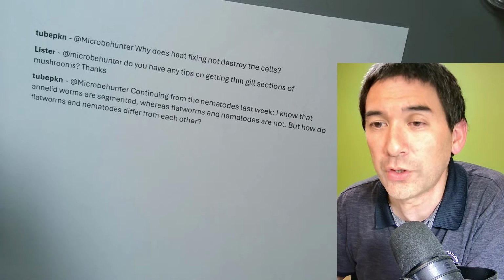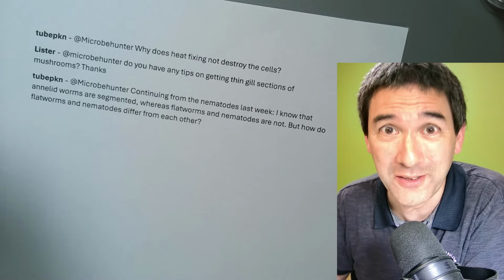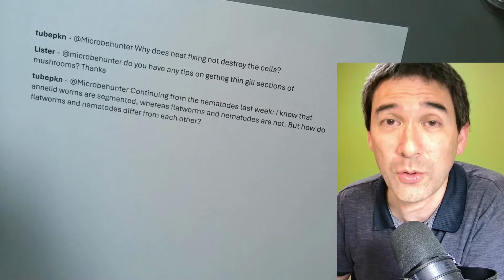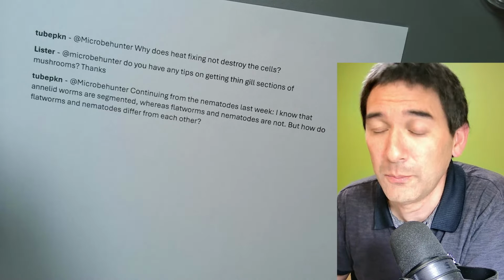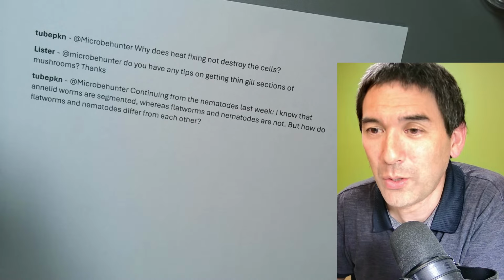Can you put yogurt under the microscope? Yes, I have done this as well. You see yogurt bacteria. As a matter of fact, especially homemade yogurt looks quite interesting. But why not try this next time as well? Okay.